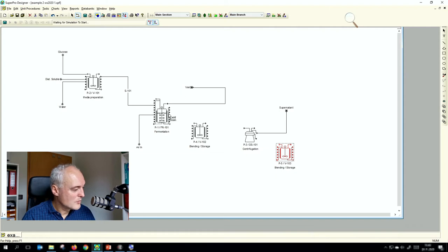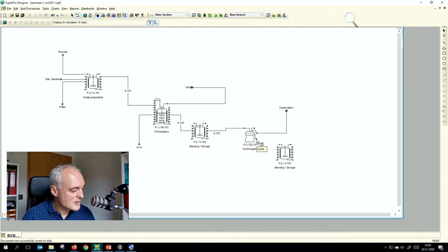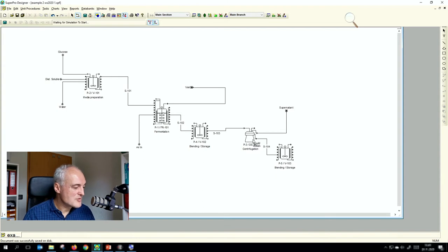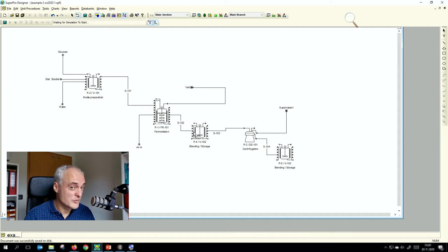We draw the streams: one stream from the bioreactor to the first blending tank, another from that tank to the centrifuge, and then a stream from the centrifuge to the last blending tank. That last stream is automatically initialized, so no problem there.